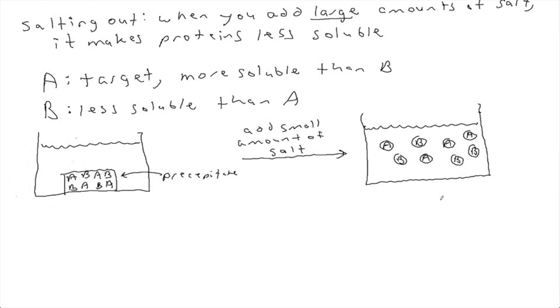Have we achieved purification yet? Or have we achieved separation yet? No, because the A and the B are still all mixed up in the solution.